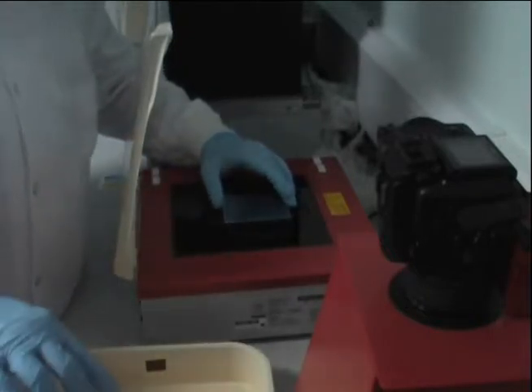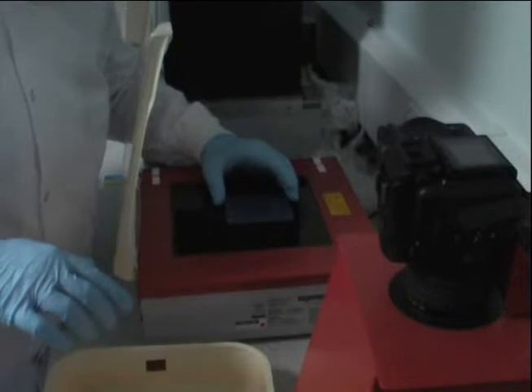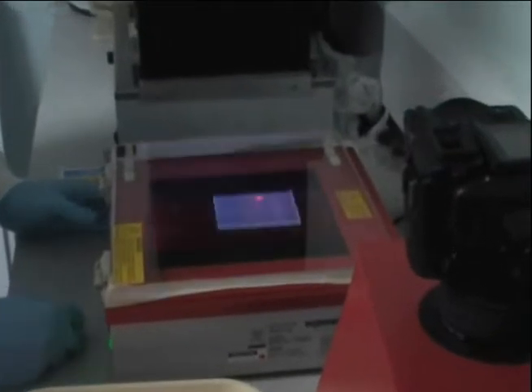Placing the gel in an ultraviolet light box allows us to visualize the PCR products we have been generating alongside our DNA ladder as they fluoresce. We can see here that our PCR analysis has indeed worked, as there are visible DNA bands fluorescing.